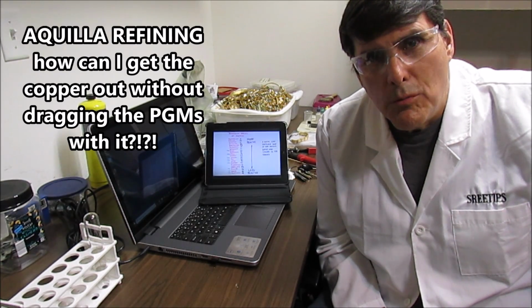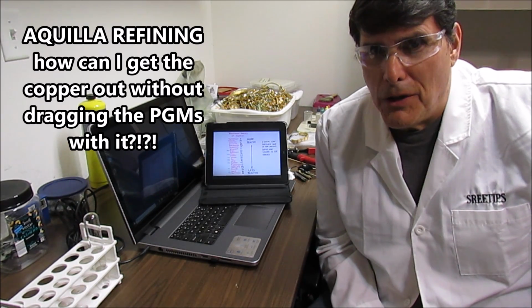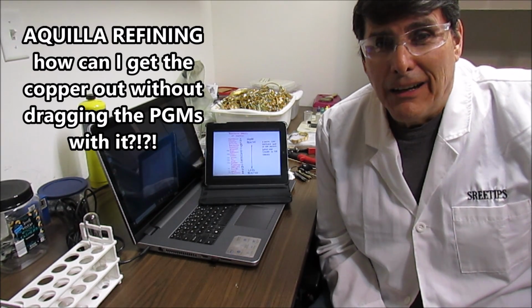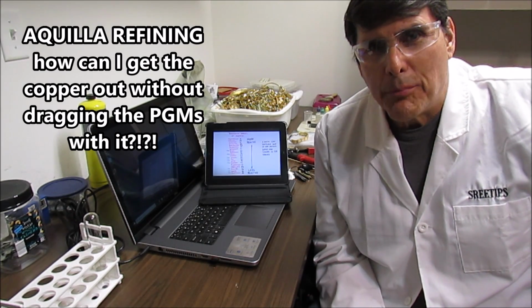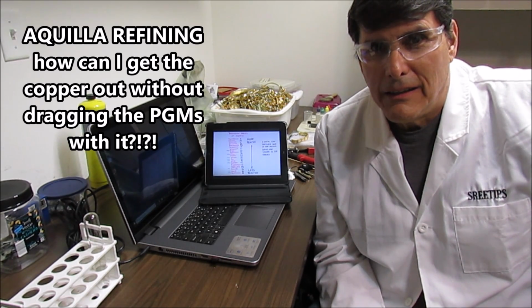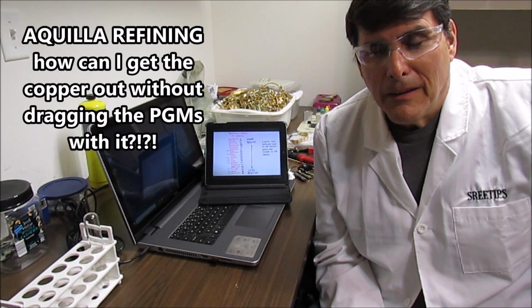So if you more experienced viewers are watching here, I'm talking Geo, Goran, Lou, Rick, Four Metals, if you guys have any kind of way to get that copper out of there before I cement the platinum group metals on the zinc, let me know in the comment section how to proceed here.